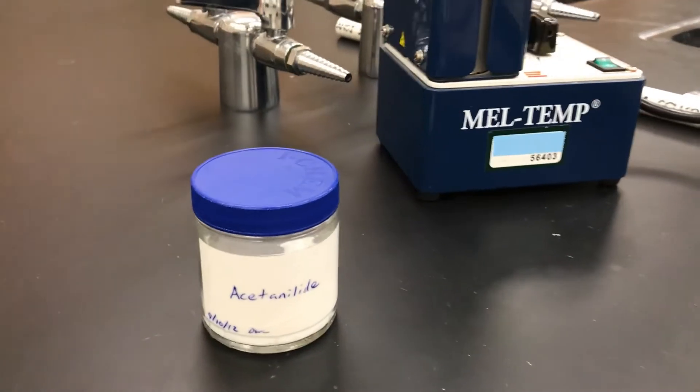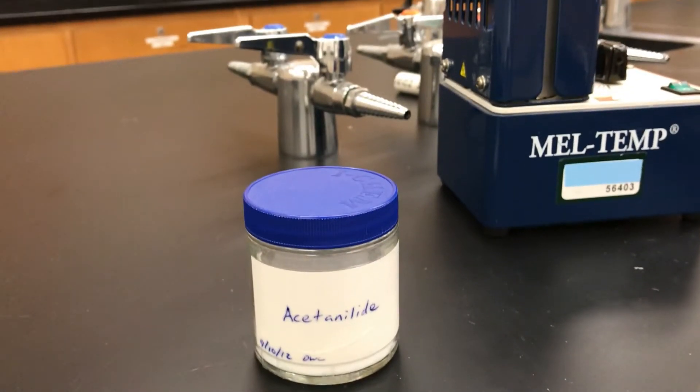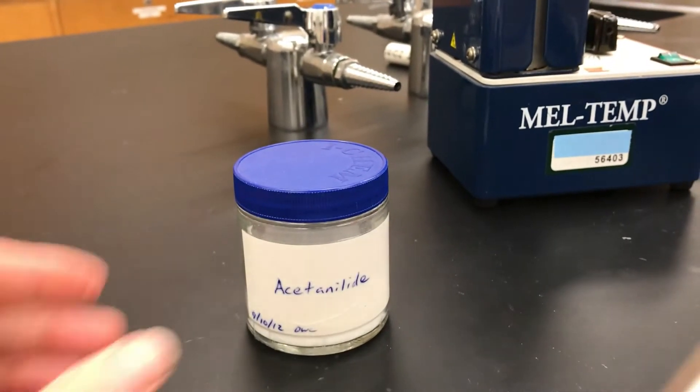Hi, I'm Lisa Nichols and in this video I'm going to show you how to take the melting point of a solid using a melt temp apparatus. The first thing you want to do is prepare your sample. I'm going to test the melting point of acetanilide.